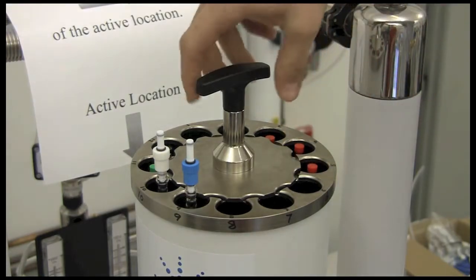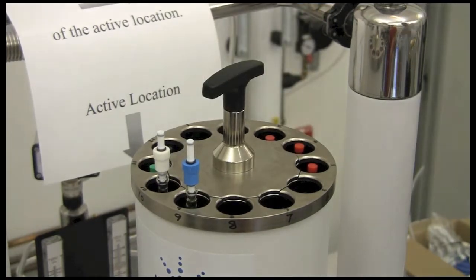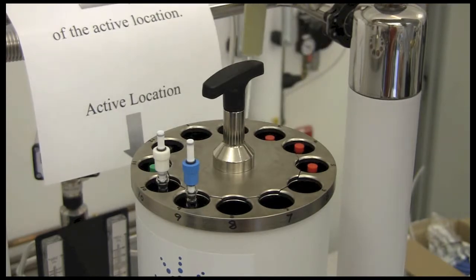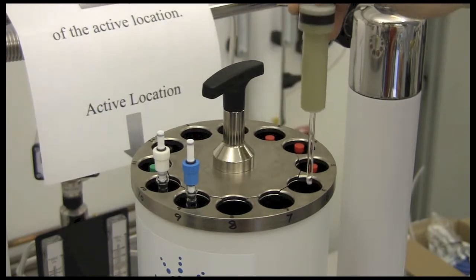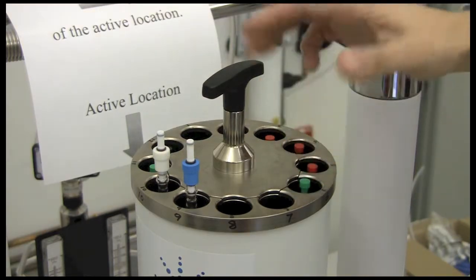In order to load your sample, you need to turn the handle counterclockwise to put it in the unlocked position. Then you need to find a location to the right of the active location, so in this case location number 6, to put your sample. You can just drop it in there.